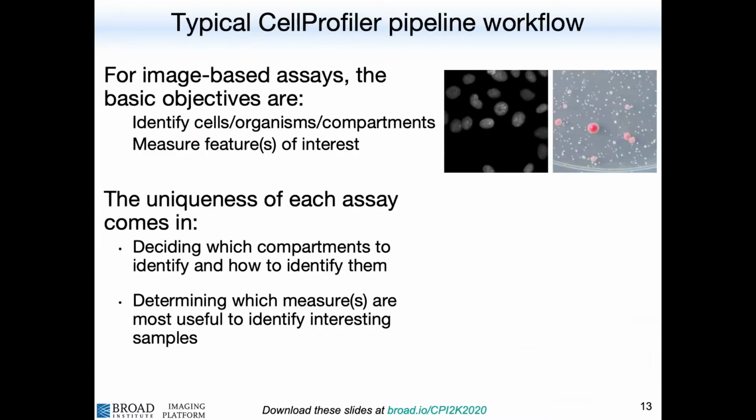Let's now think about how we actually tap into an image analysis workflow. The workflow for analysis is really two steps. One is identifying the objects that we care about, and then making measurements from them. As we said, the hardest part is figuring out how to find the objects we care about.